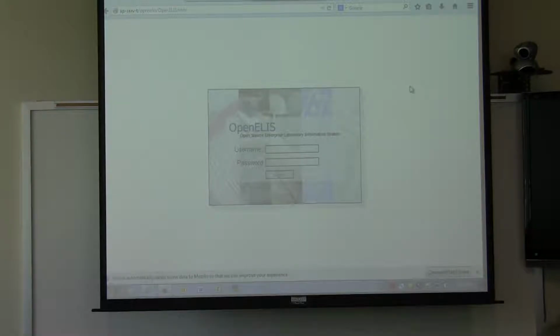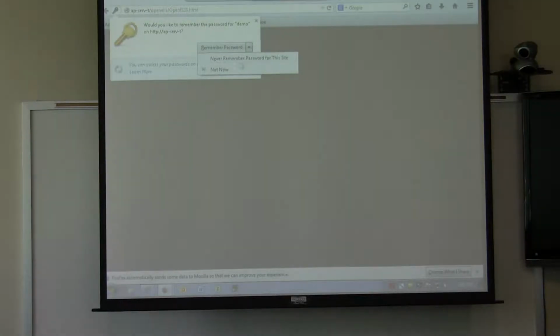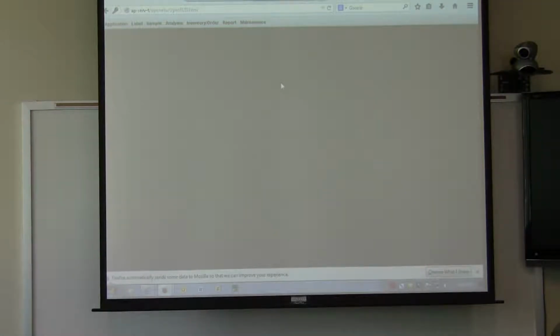This is the OpenELIS Worksheet Completion version 2 training, an introduction and training. Hopefully you guys will be blown away by what we're doing here today. Okay.